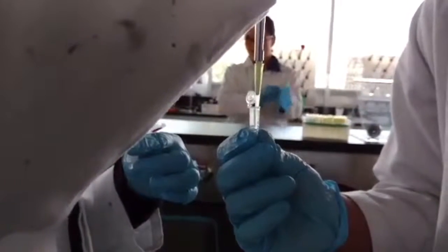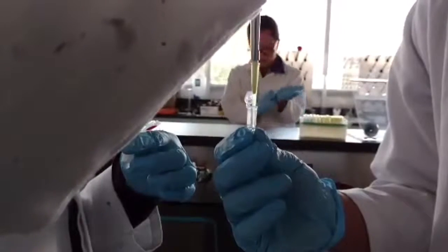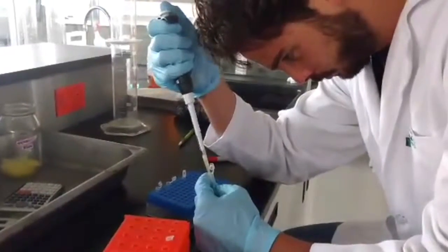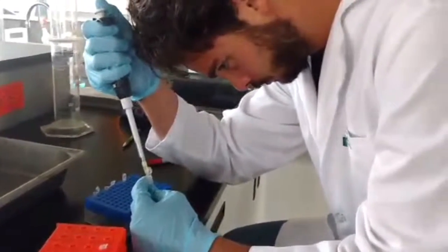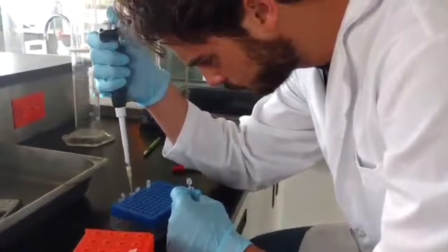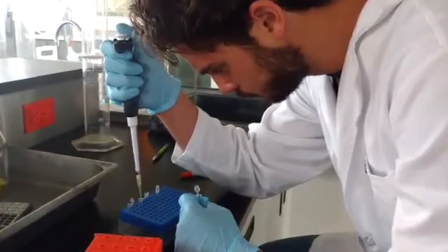Magnesium concentration usually is between 0.5 and 5 millimolar for the template set. Cycling temperatures are important for the denaturation and amplification to take place during the PCR.